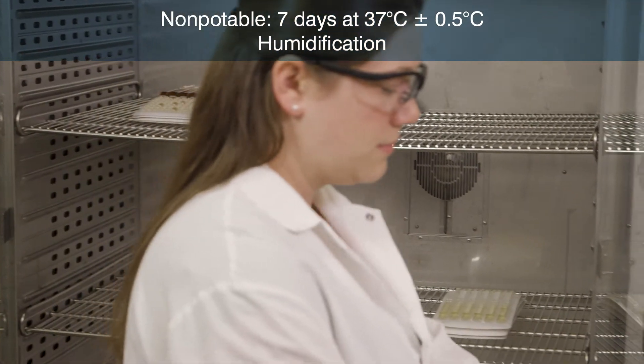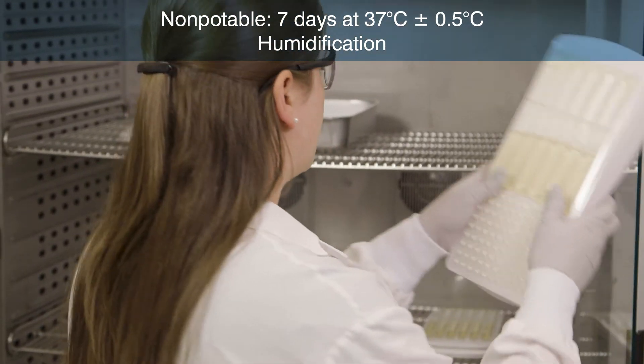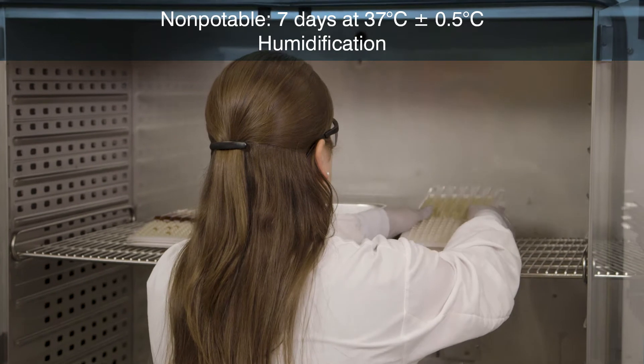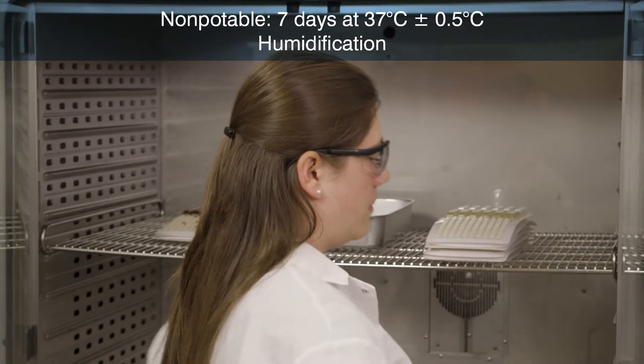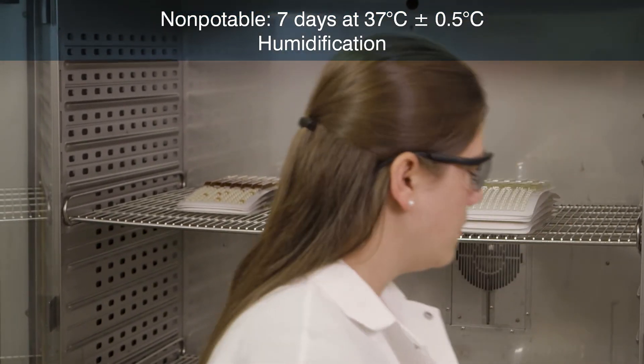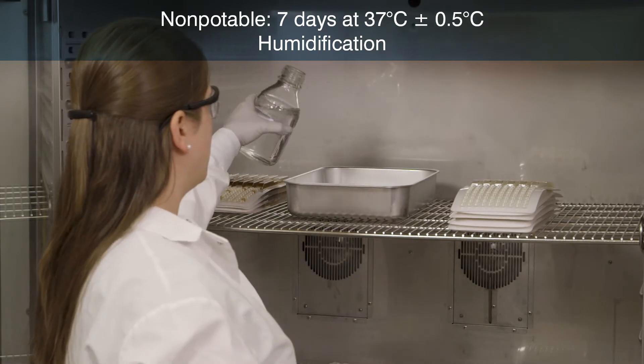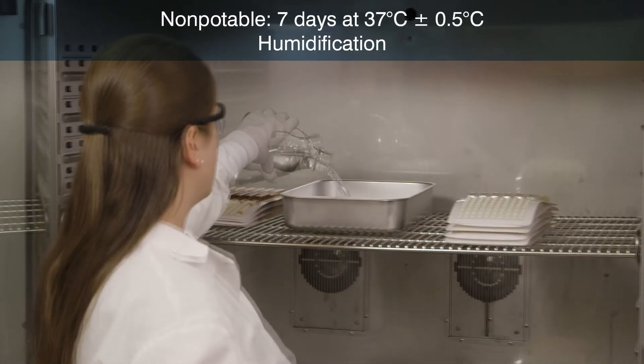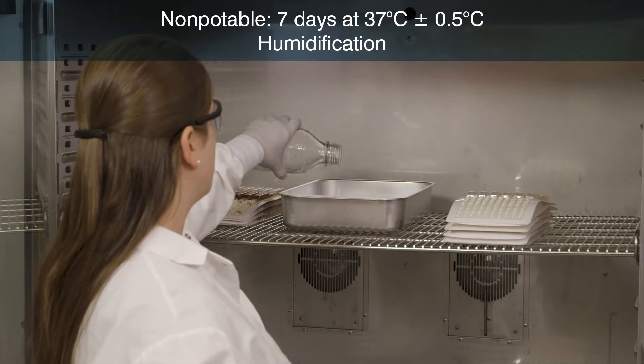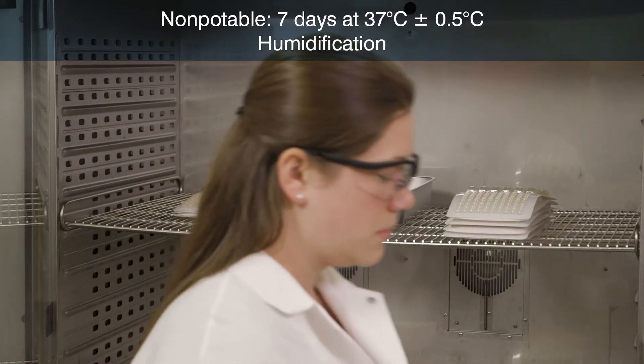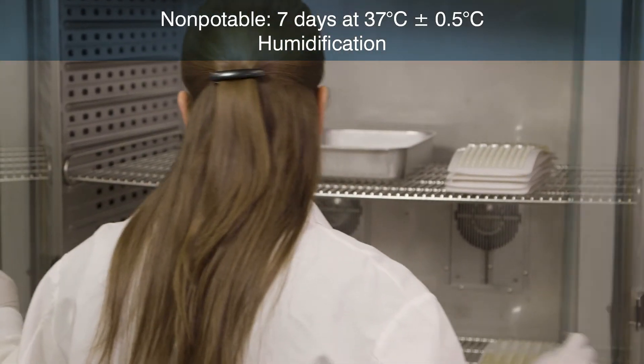Incubate the sealed tray paper side down for 7 days at 37 degrees centigrade plus or minus 0.5 degrees centigrade. To prevent trays from drying out, humidify the incubator. If stacking trays, alternate tray direction so large wells are placed above small wells.